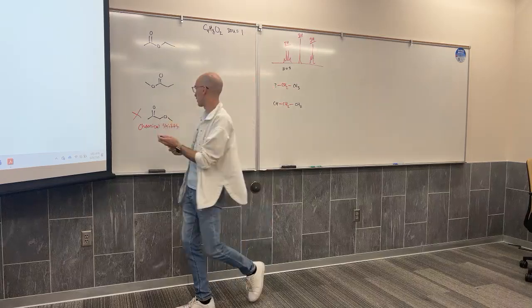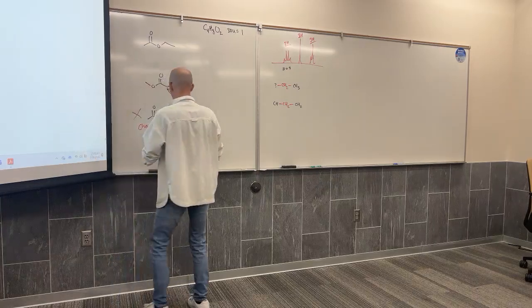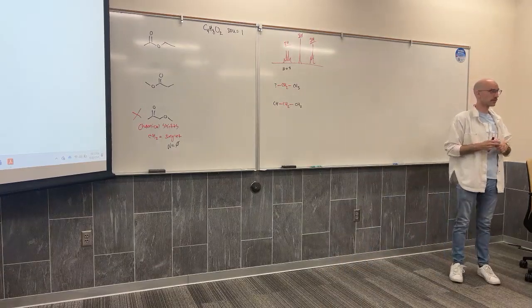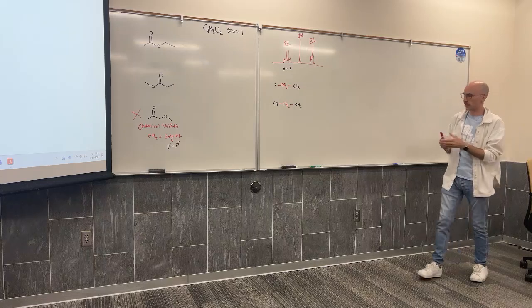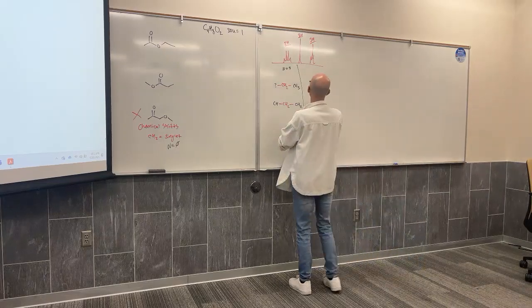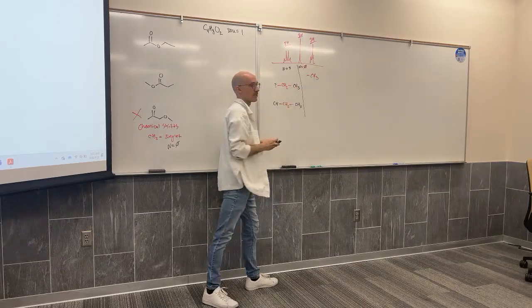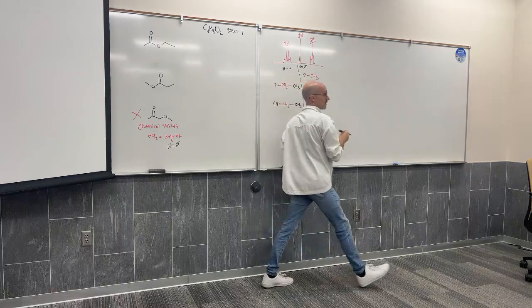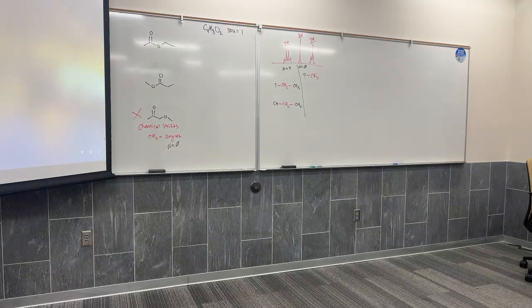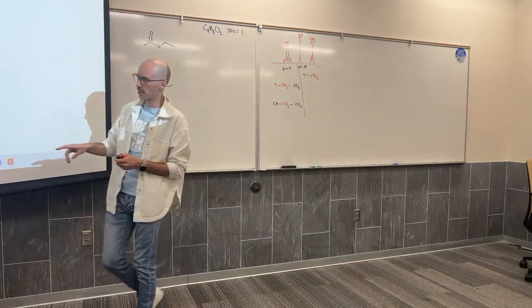This structure actually does not. This CH2 group has no neighbors. That CH2 group should be a singlet. So it's not that bottom structure. Okay, moving on then. We need to have a CH3 group that has how many neighbors? 0, because it shows up as a singlet. What's next to it? Can't necessarily say, but it doesn't have any hydrogens attached. And is this signal in the functional group region or functional group adjacent region?